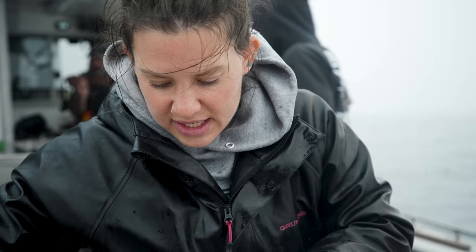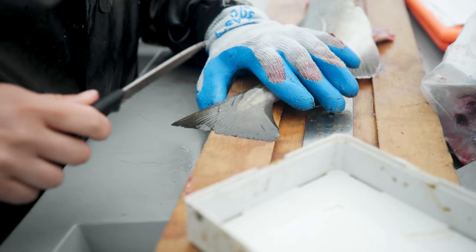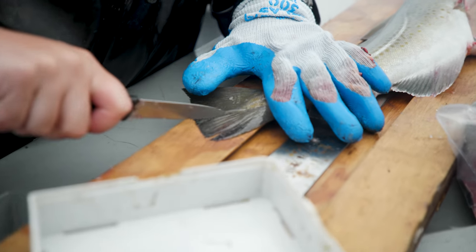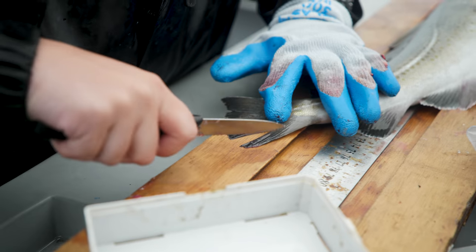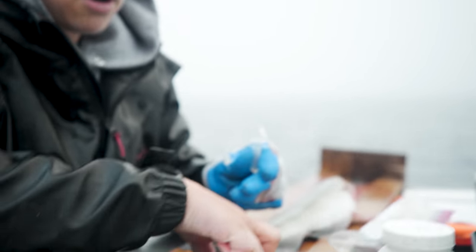The last sample that we take is one of these fin rays from their caudal fin — their tail fin. Kind of like how hair or spit from a human gives you DNA information, this is where we get a lot of the DNA from fish — from these fin rays. I'm just gonna cut that one off and it's going into ethanol as well.